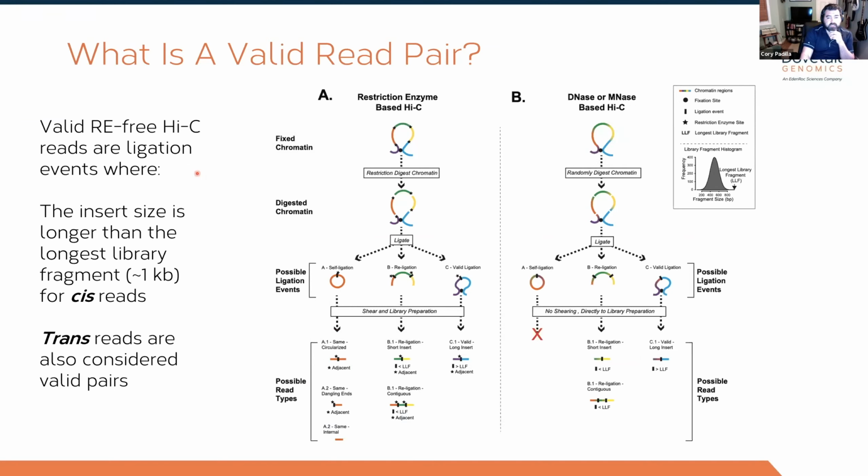So first, I think we need to set one definition here, which is what is a valid read pair. If you're thinking about Hi-C, restriction enzyme-based Hi-C, or if you've never worked with Hi-C data before, this is a good refresher.